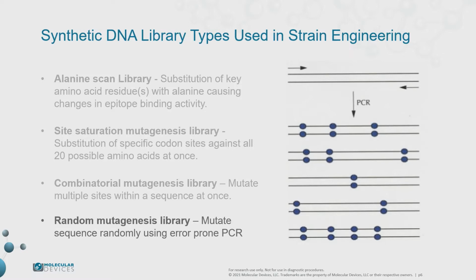These techniques can be used to build antibody libraries, promoter regulation libraries, and quite often many of these library types are constructed simultaneously, resulting in tens of thousands of clones and large DNA libraries to screen for favorable phenotypes.